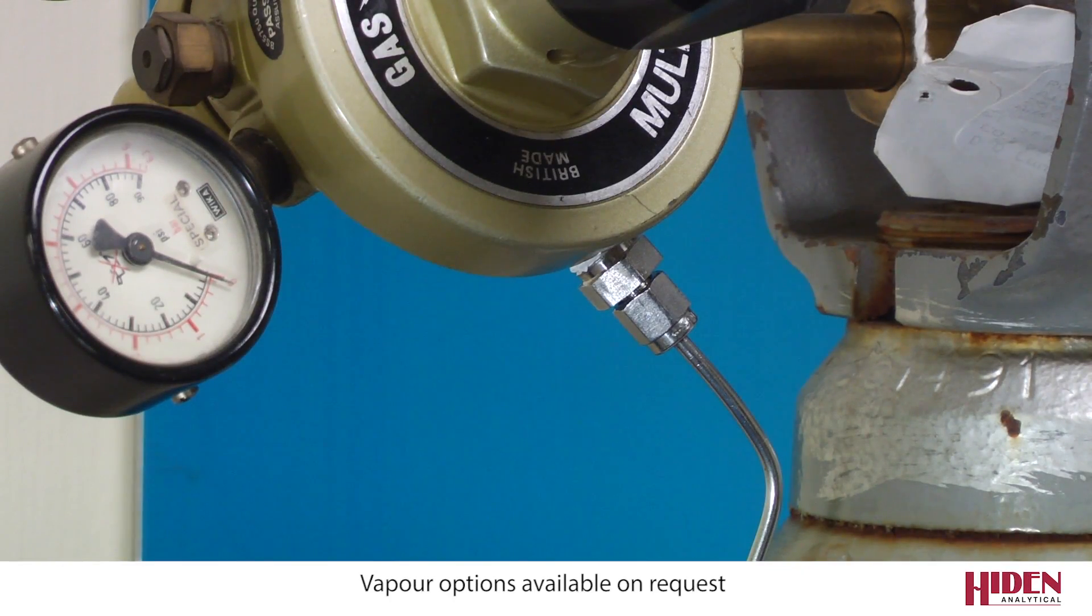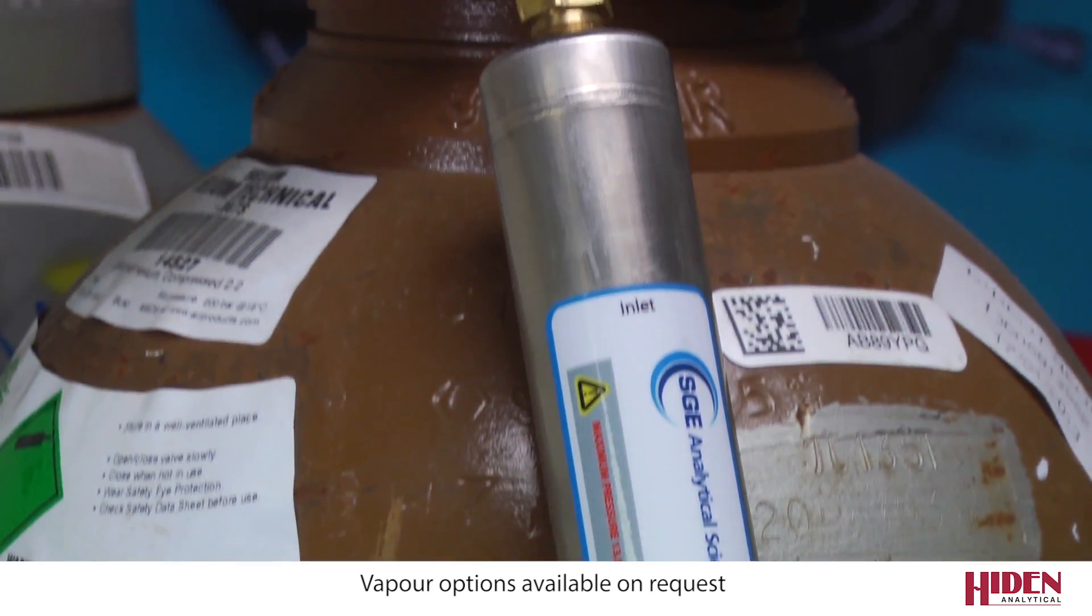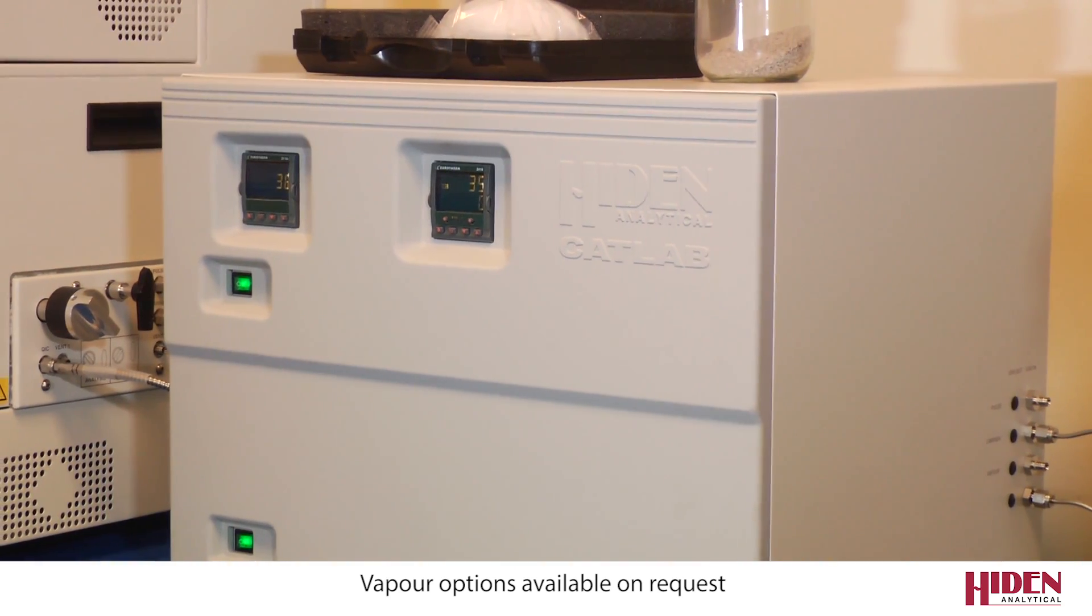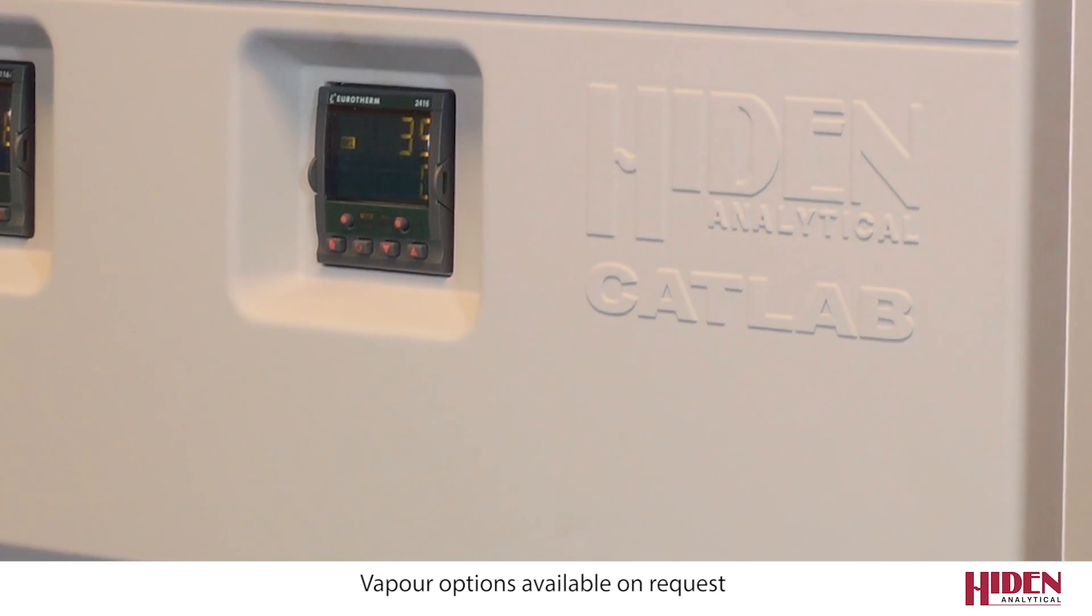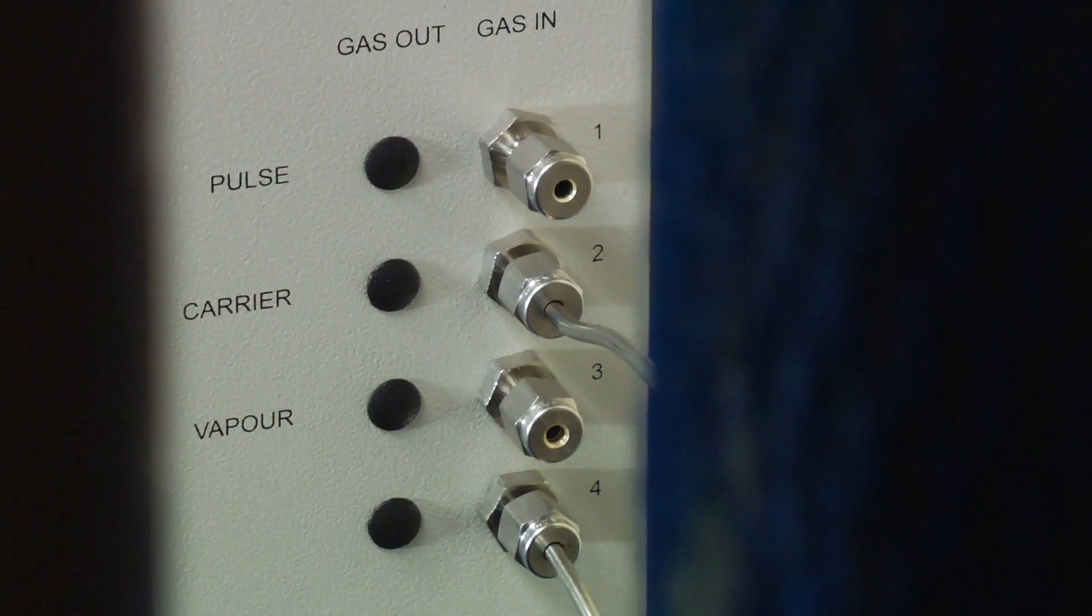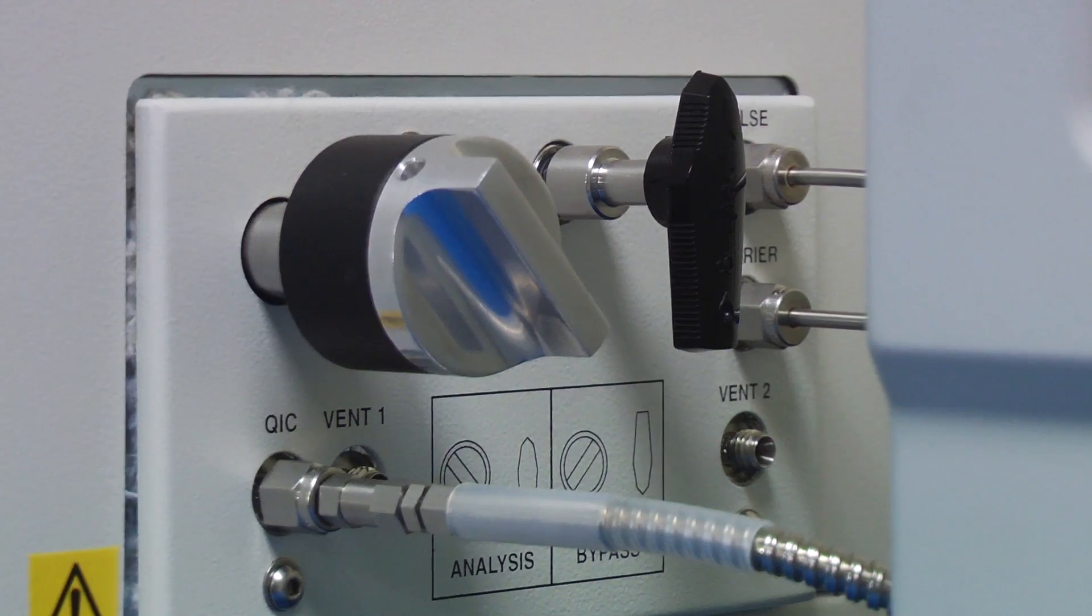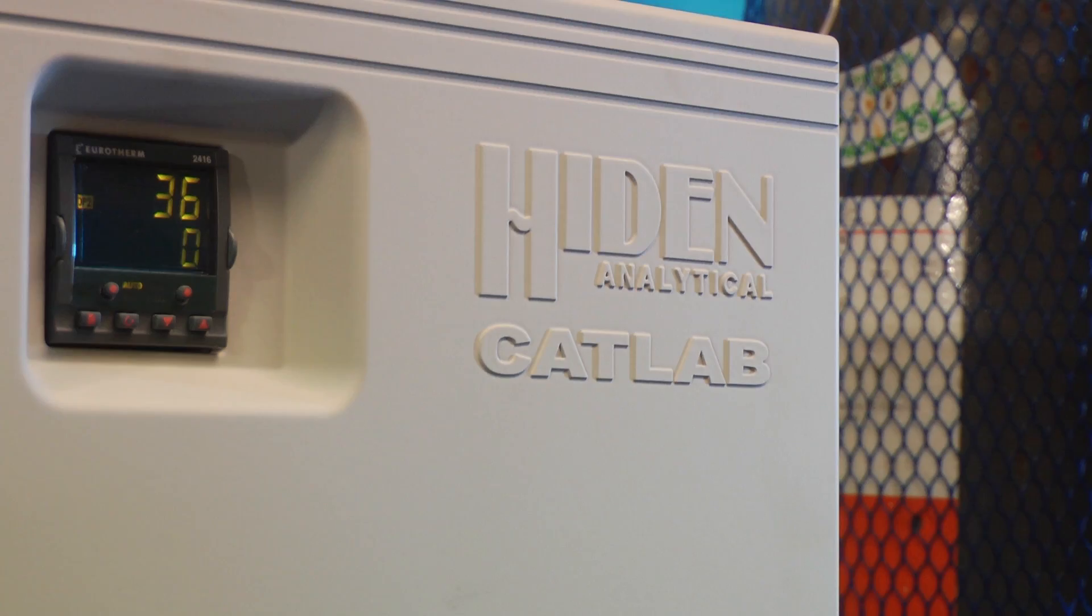Gas mixtures in the reactor are controlled using the gas and temperature control unit. This unit includes four mass flow controllers as standard with automated switching valves to switch between continuous and pulse flow measurements. Connections throughout the system from the gas supply to the mass spectrometer are all standard 1/8 inch Swagelok connections.